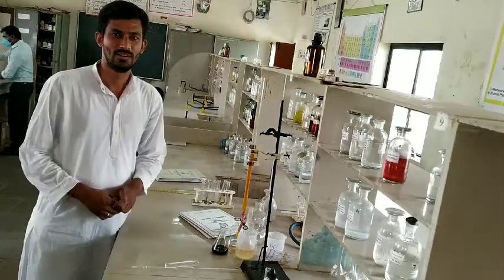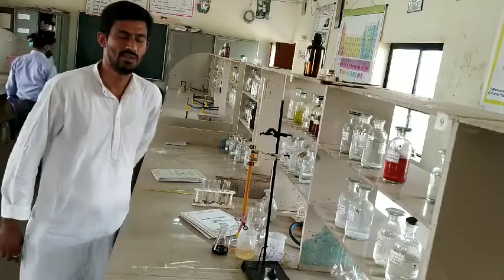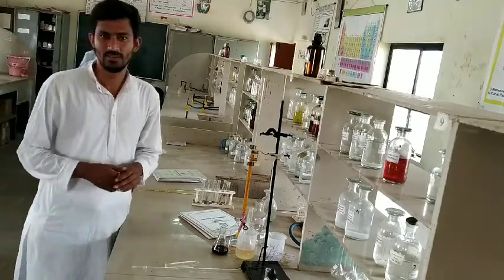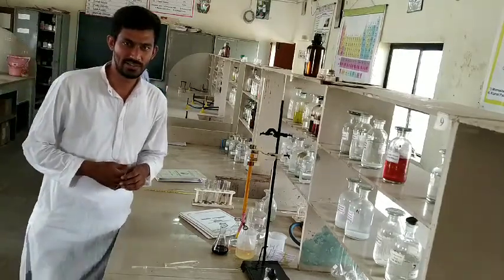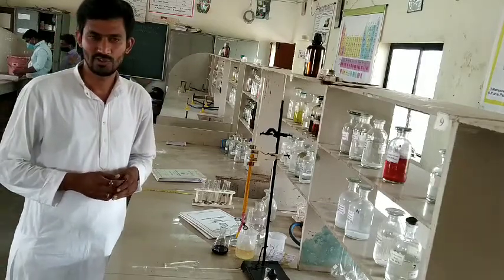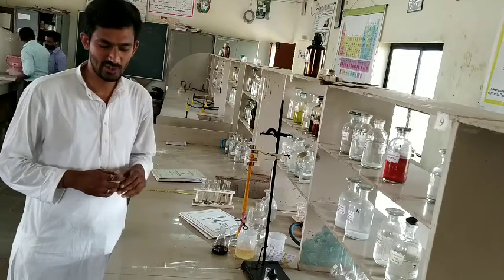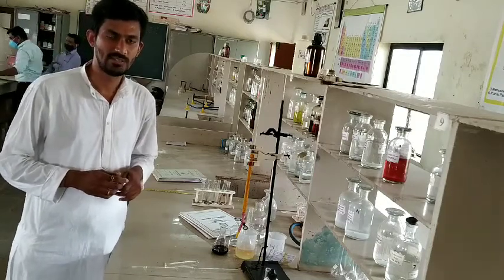Good morning to all of you. Today we discuss the FIBSC practical number two, that is analytical chemistry: preparation of standard 0.1 normal potassium dichromate and standardization of ferrous ammonium sulfate.